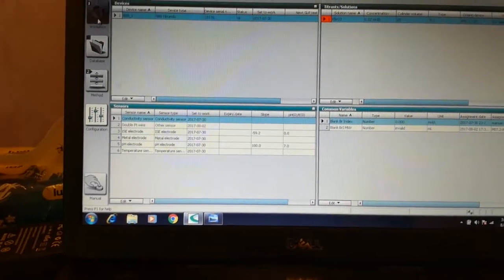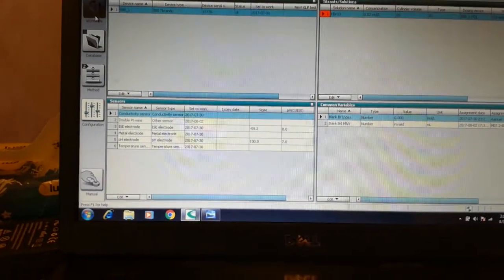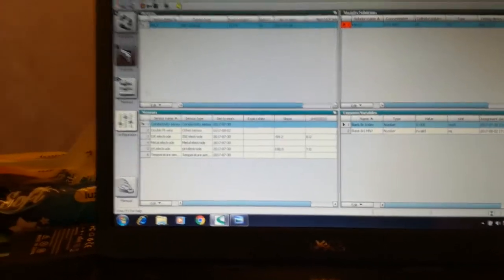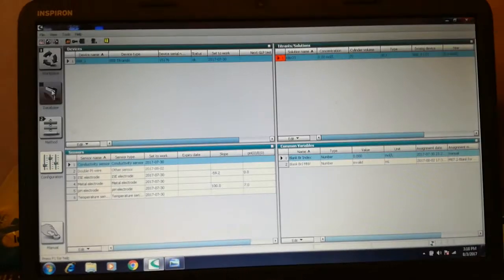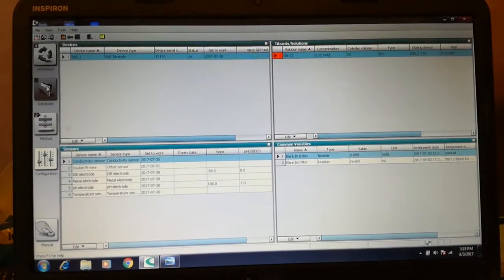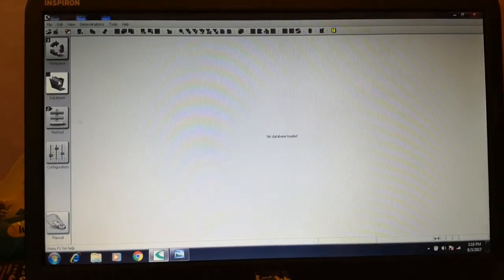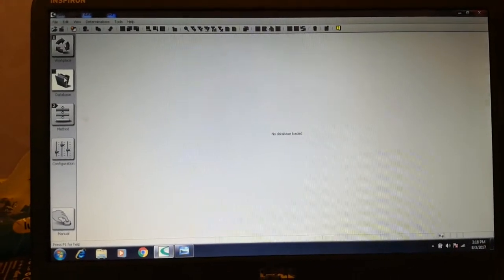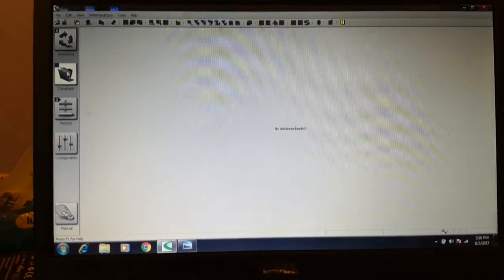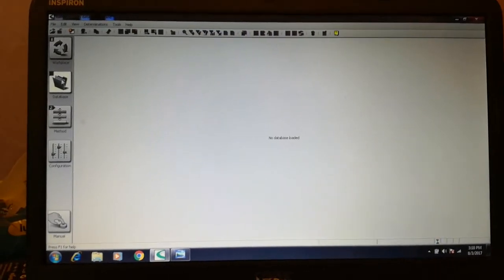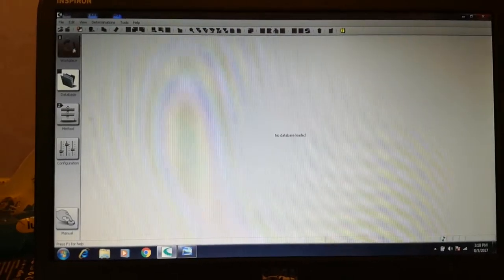Let's return back to the workplace. In the database window you will see the results of all the measurements you are going to implement.